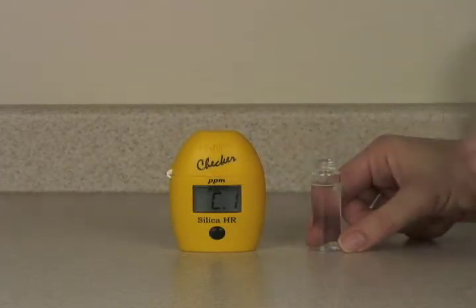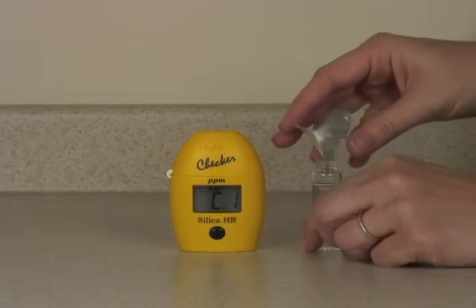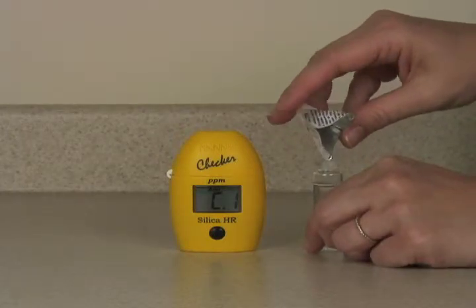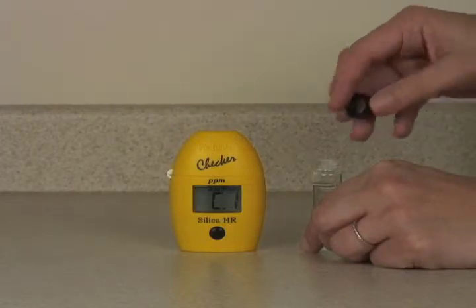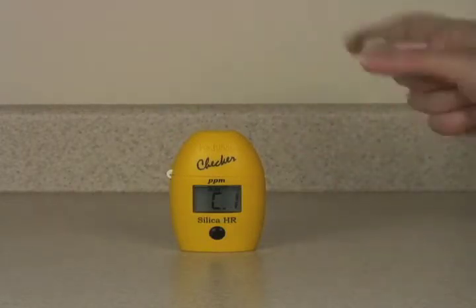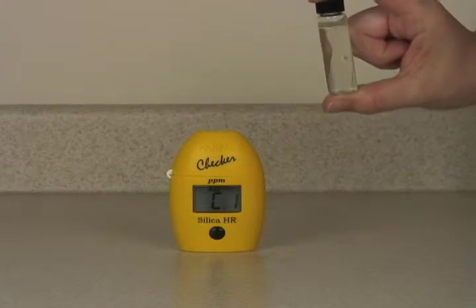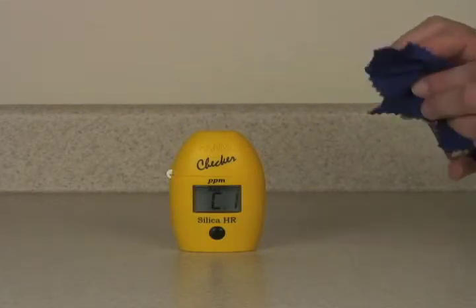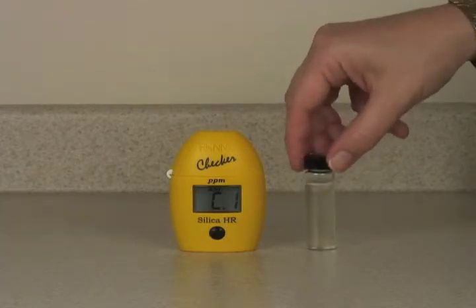Now we're ready to add reagent B. We'll shake vigorously until this reagent is dissolved. And now we will wait 10 minutes.